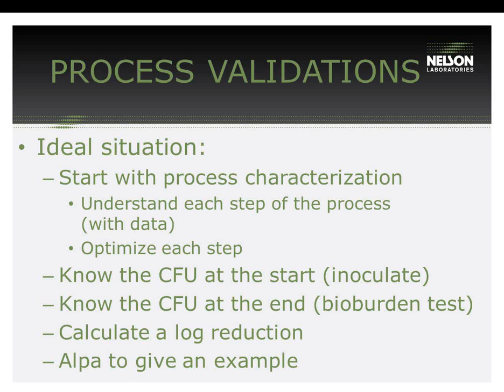And then with an understanding of the CFU at the start and at the end, where we're talking about performing a bioburden test rather than sterility testing at the end, and Alpa will discuss that in more detail, then you get really good information regarding log reduction capability of that overall process. And like I said, Alpa will provide an example of this.